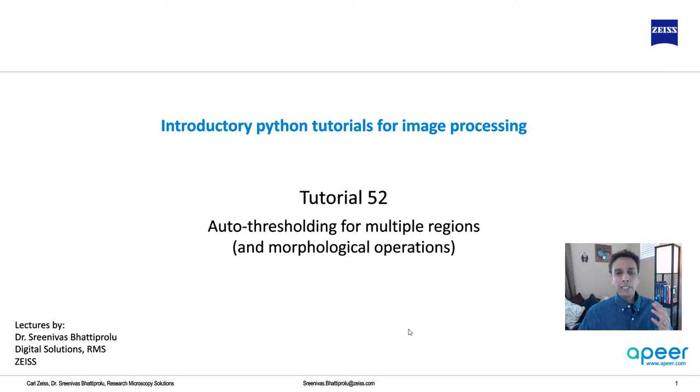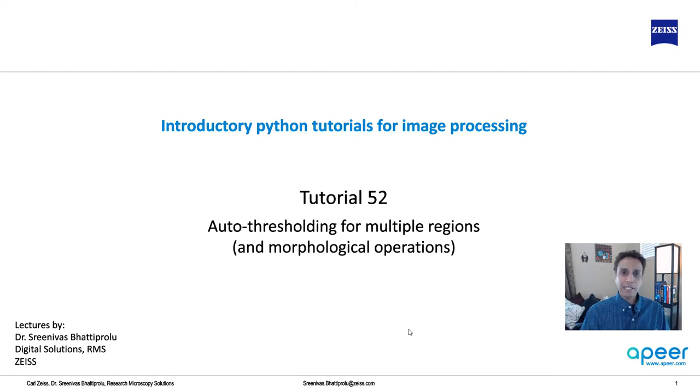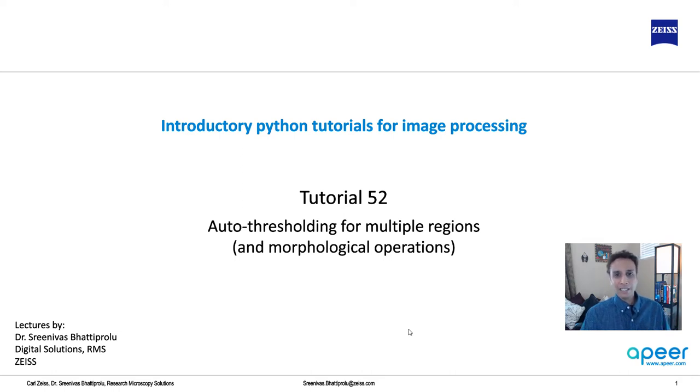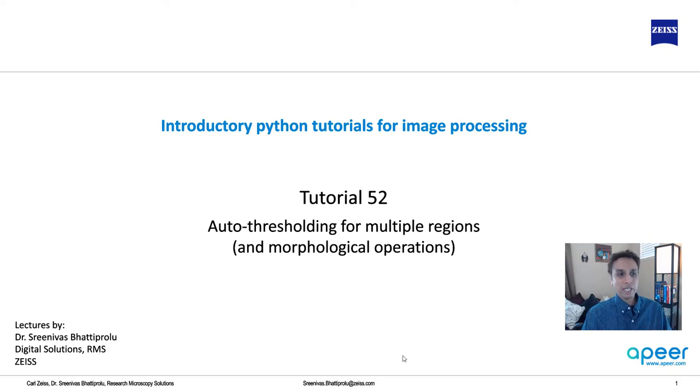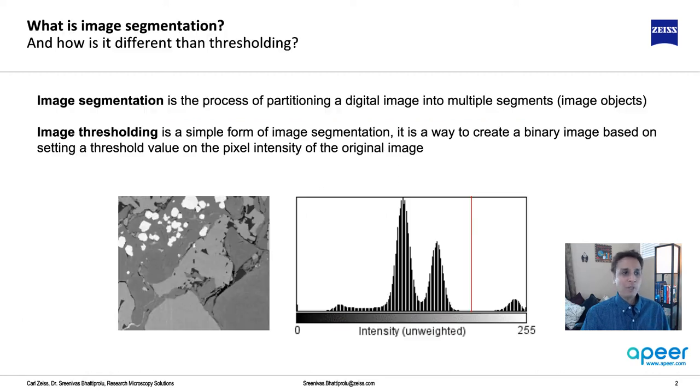In this tutorial let's build on that. Instead of binarizing the image, what if we have three, four, five, six different regions of interest that we're interested in segmenting? This tutorial uses a variation of OTSU to do exactly that, and then let's take it further by understanding morphological operations to clean up the segmented image.